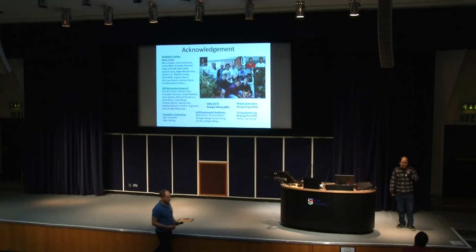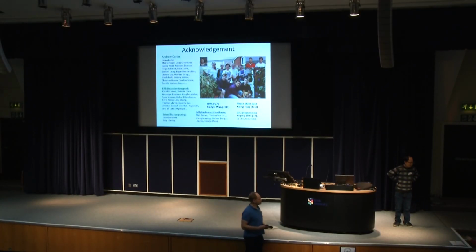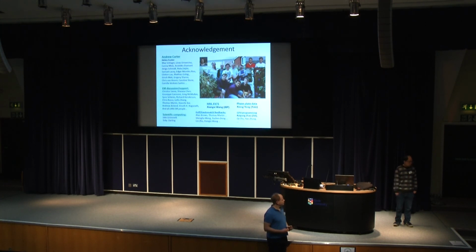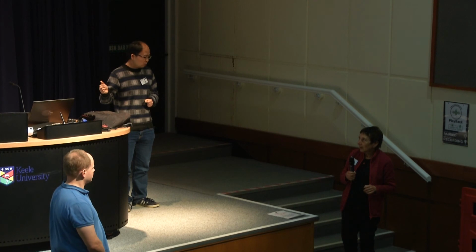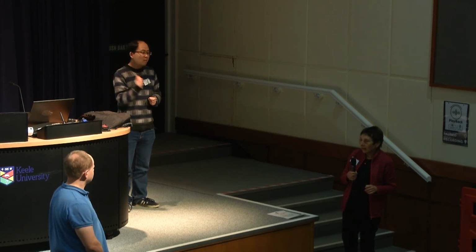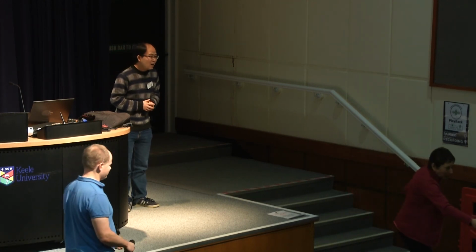Okay, I think we're running out of time here, so this was all very interesting. But is that specific to a particular microscope? That curve, that deviation, is that per microscope? If you did it on different microscopes, you would see a different one. Yes, one microscope. For different microscopes, it will be different. And actually we can adjust the microscope value using the re-estimated value from the computational approach to compensate the error on each microscope. Okay, it's the calibration.